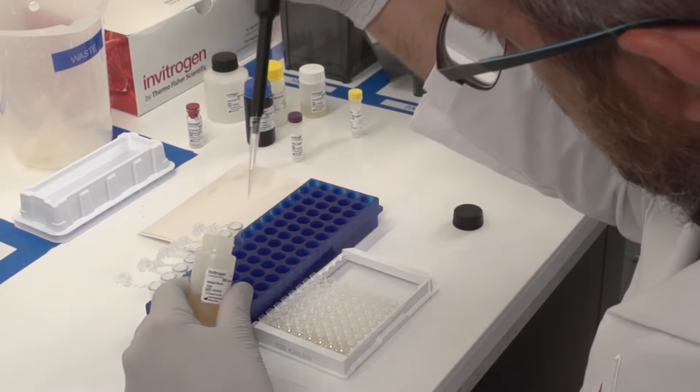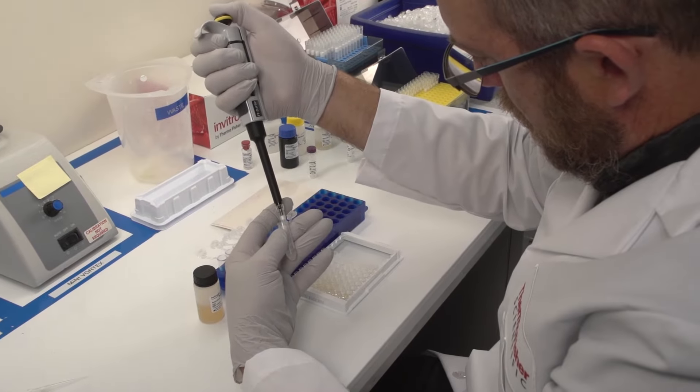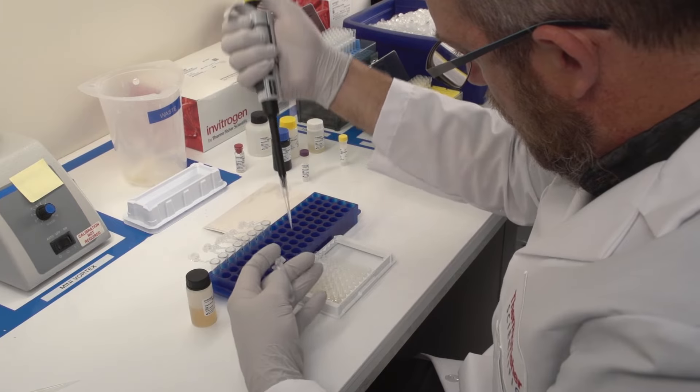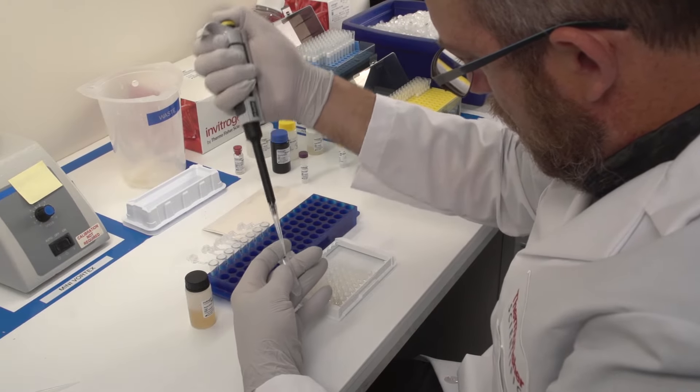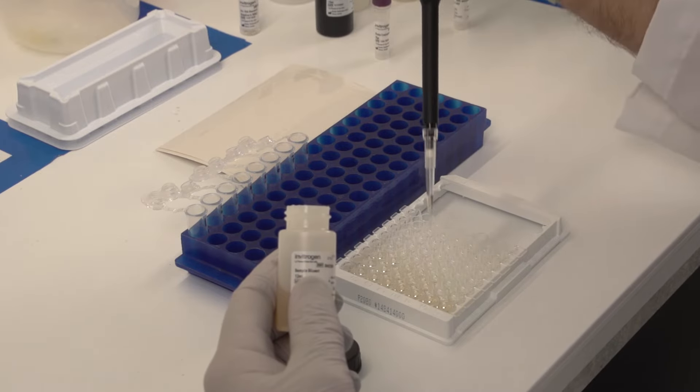Add standards, controls, and samples to the ELISA plate. Note that some samples may need to be pre-diluted, and some protocols may call for a sequential or co-incubation step with the detector antibody.